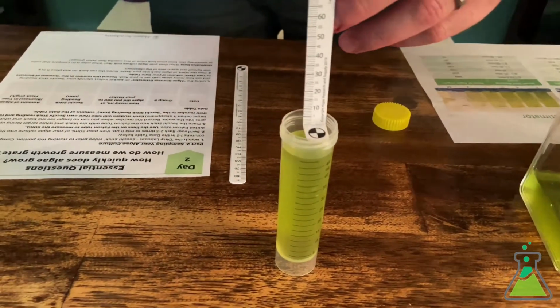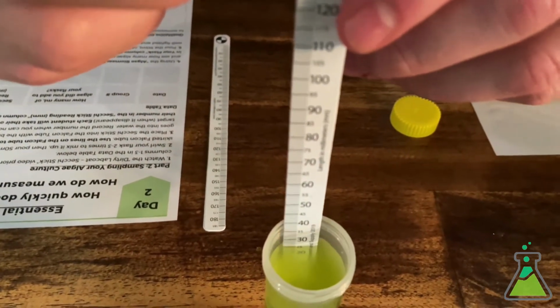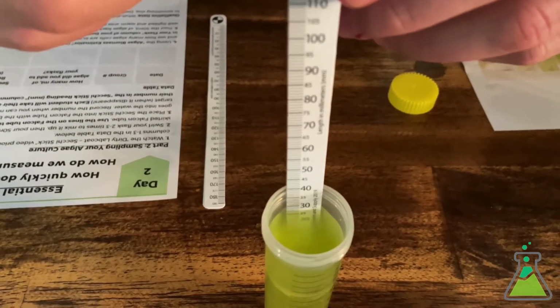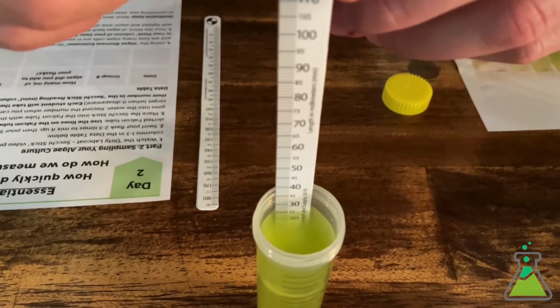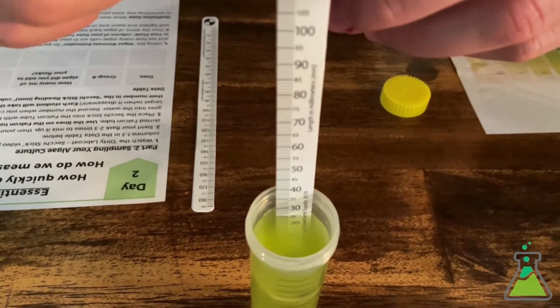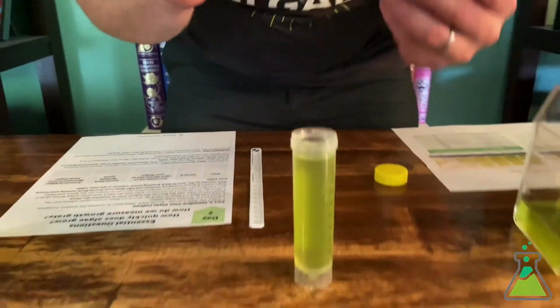All right, so here we go. So we're going to go down through the culture. I can still see it, and it looks like it's disappearing right about there. And that looks to be 25 millimeters on our ruler. Perfect. So we'll go ahead and pull this out.